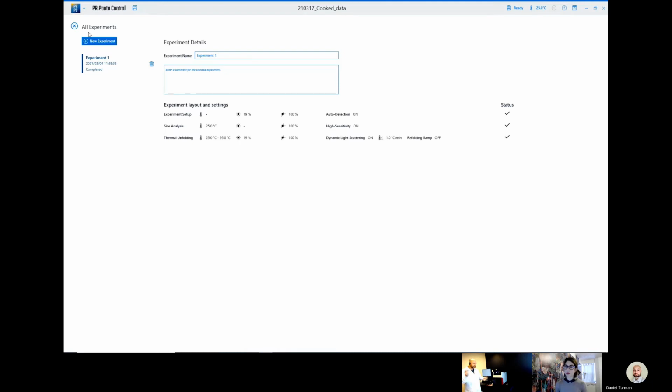I will say that also when you load the capillary, be mindful of having no bubbles in the sample. You don't want to have bubbles in your capillaries, and they will be introduced if they're in your sample. So you can give your sample a quick spin before to remove bubbles, excuse me. Right, so maybe thinking of filtering or centrifuging your samples prior to loading.